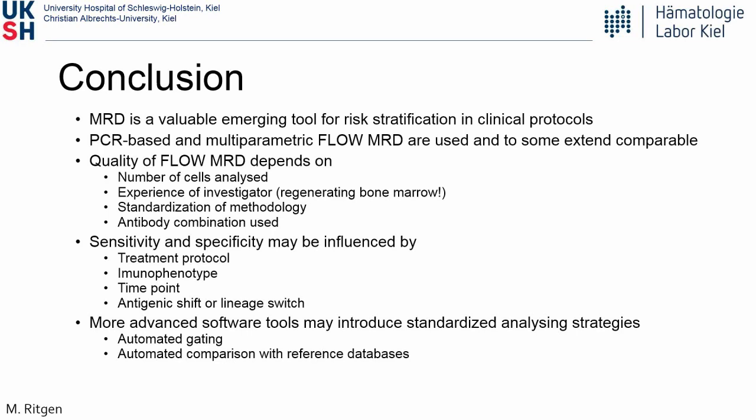Absolutely. And if the sample is diluted, would you still go for as many cells? What's your recommendation? Diluted with peripheral blood, I guess, is the question. Well, this is a problem, that's true. We look for red cell progenitors or erythroid progenitors in the sample, and if this is below 1 or 2% of the sample, we give advice that this is a sample which might have been diluted by peripheral blood. This was introduced by the IBFM group, which recommends using this as an internal quality control.